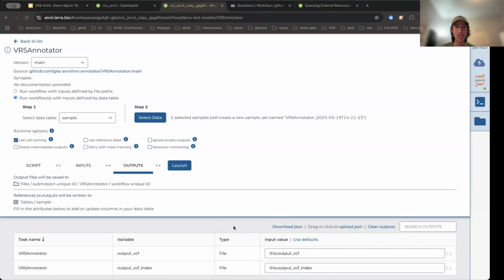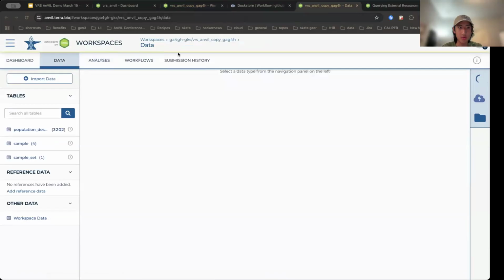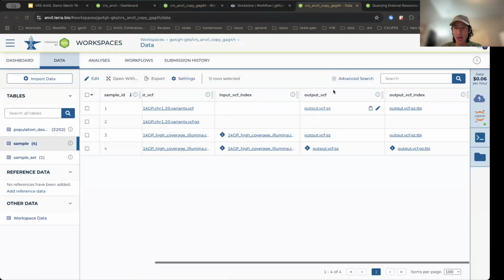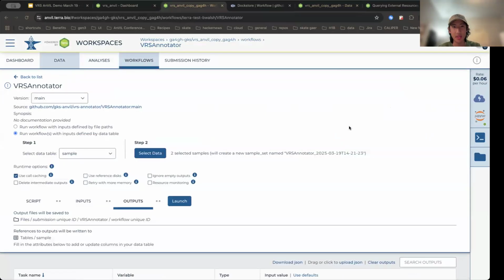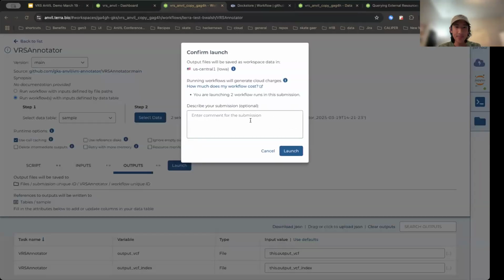And that's super helpful because then, jumping over real quick to those data tables, you don't have to write those yourself; they get written automatically for you. Just a quick tip and something that I feel is helpful when running workflows.